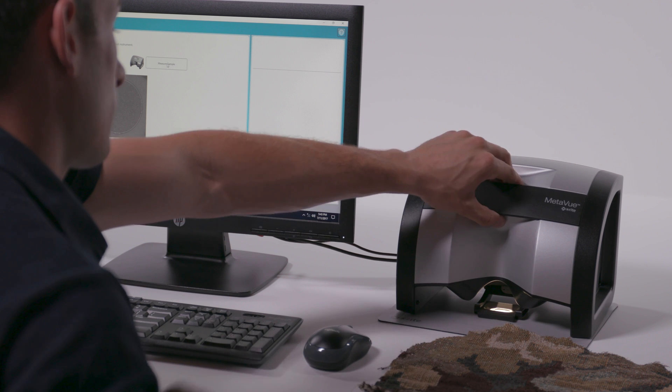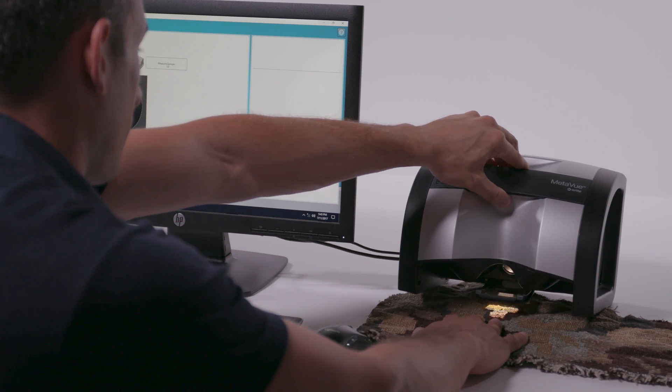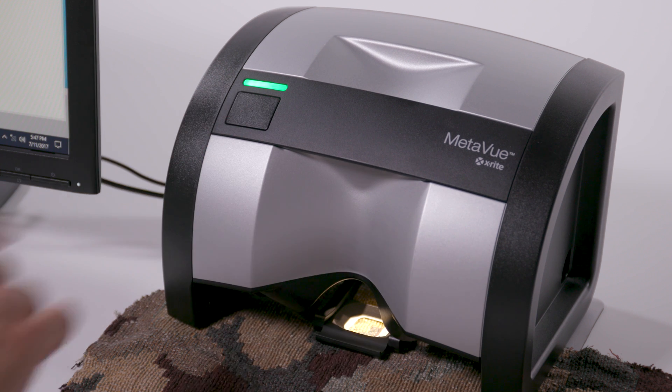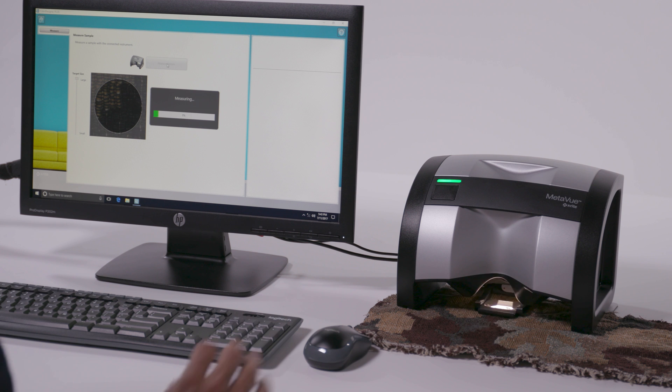Ergonomic design makes the device easier to move and position and helps you measure difficult samples from multiple positions. MetaView also features a measurement button on the device, allowing you to initiate measurements from both the software and the device.